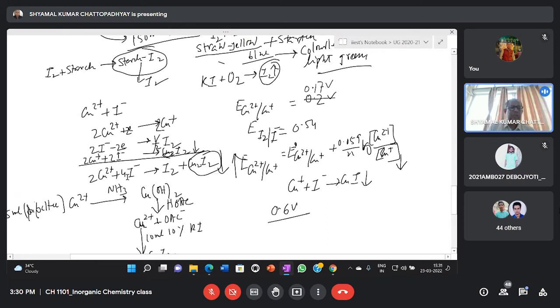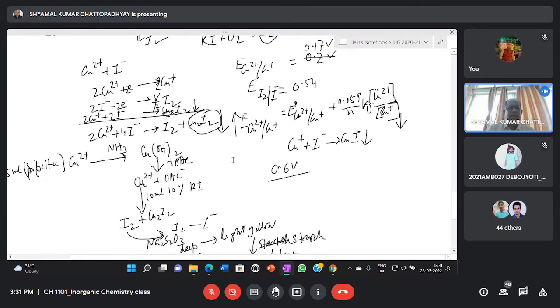Okay, so that means 2 iodide ions are simply used as an anion for complexation of the Cu+ ion, and 2 iodide ions undergo redox reaction. They are oxidized to iodine. So here cupric ion is reduced to Cu+ and iodide is oxidized to iodine, and this we shall estimate. The liberated iodine is titrated using sodium thiosulfate, and from there we can know how much cupric ion is present. So what is the procedure?